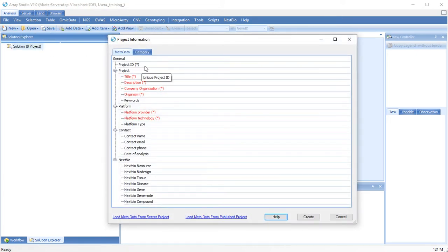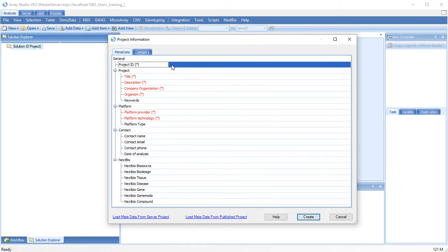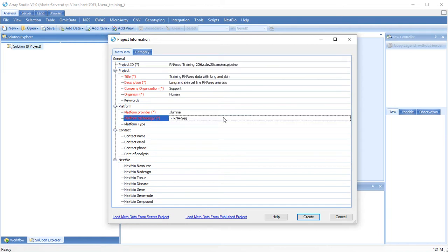Depending on server settings, users will have to input different levels of data. For this tutorial, I will be using data from CCLE with 40 files, 20 samples of paired-end lung and skin cell lines. Once you have filled out all the fields, you can create your new project.